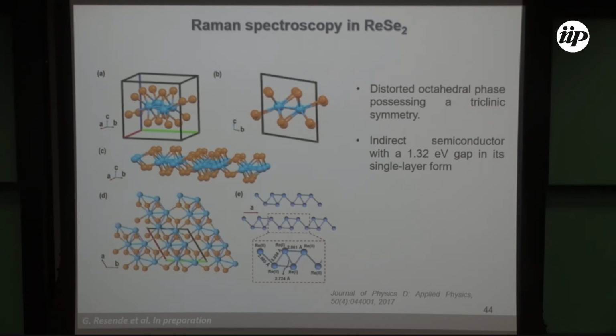So, all right, we know everything right now. We made measurements, me and several students and postdocs at the lab by the time, and we now understand what the Raman spectrum and the Raman bands are for semiconducting TMDs. They are stable. They have the hexagonal 1H symmetry, basically.